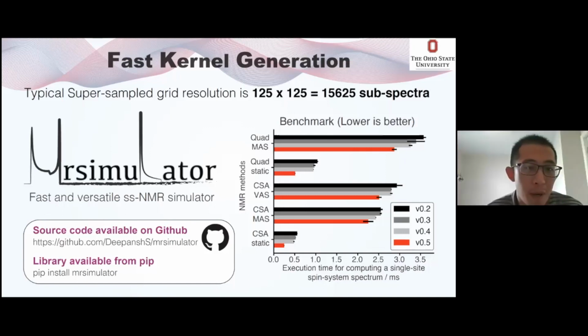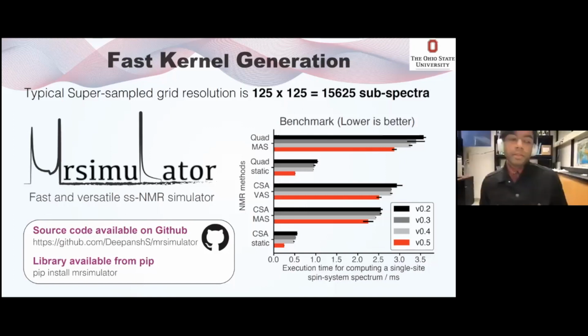Another question from Brennan Water. Great talk. If you have a single site, would you ascribe the width of the probability distribution to parameter uncertainties? Then for real parameter distributions like in glasses, can you determine uncertainties on, for example, average zeta? Yeah, so the uncertainties that we get are actually manifested in these distributions themselves.